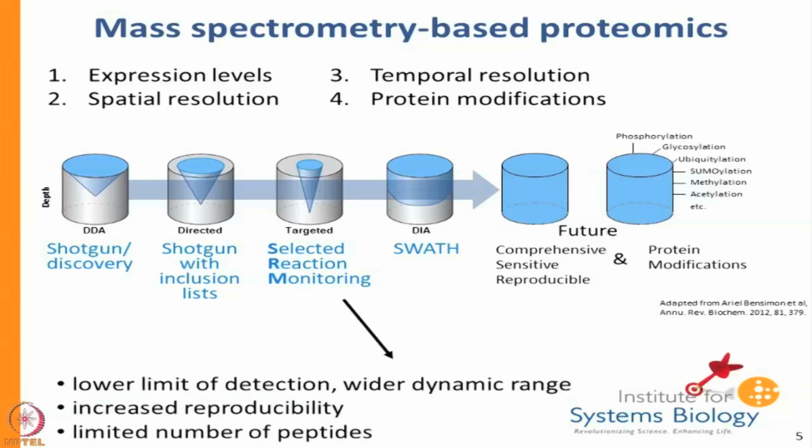Yes, that is generally correct. Almost all of these techniques that require precursor information originally rely on DDA experiments. And there are a number of ways you can get deeper into a DDA experiment: by doing fractionation, by doing longer gradients, by doing different cell types, by doing subcellular fractionation. So by really beating this technique to death, you come up with inclusion lists for this, and it turns out for SWATH.